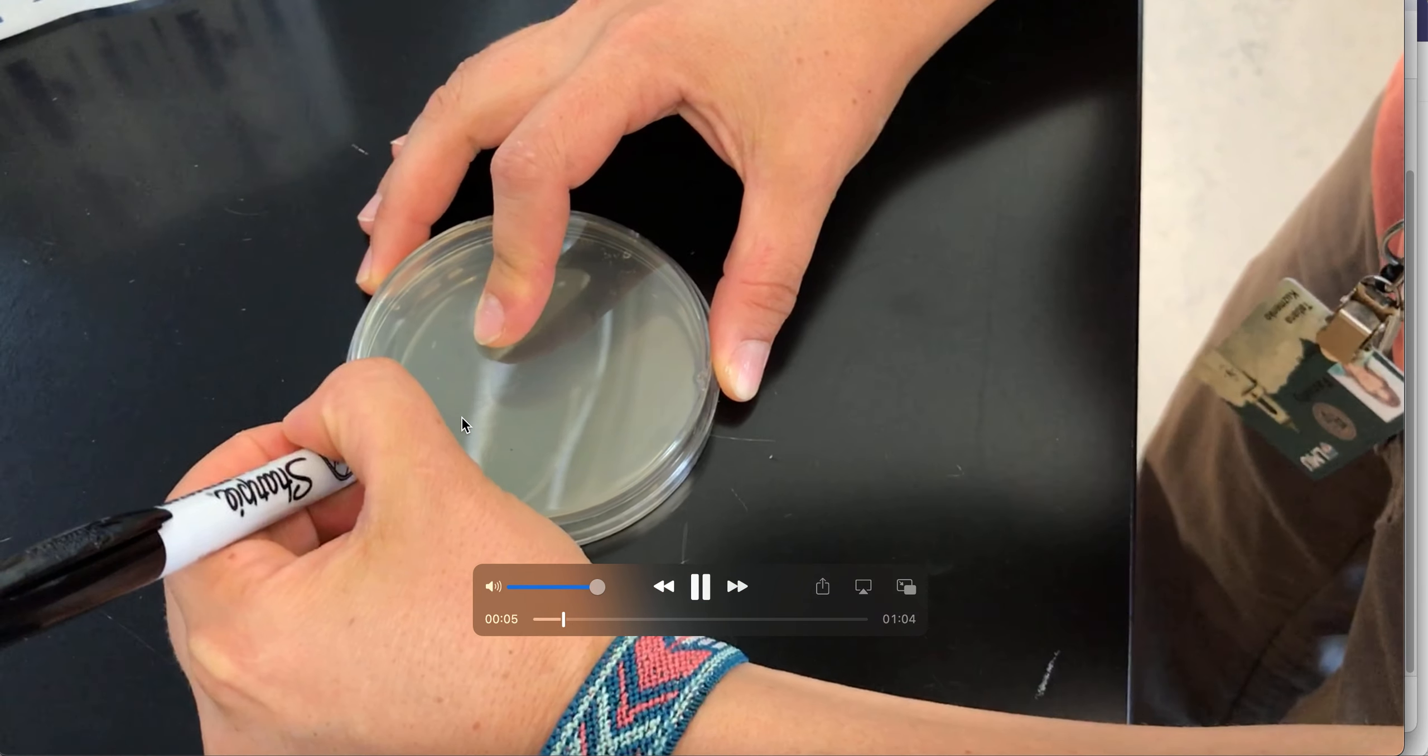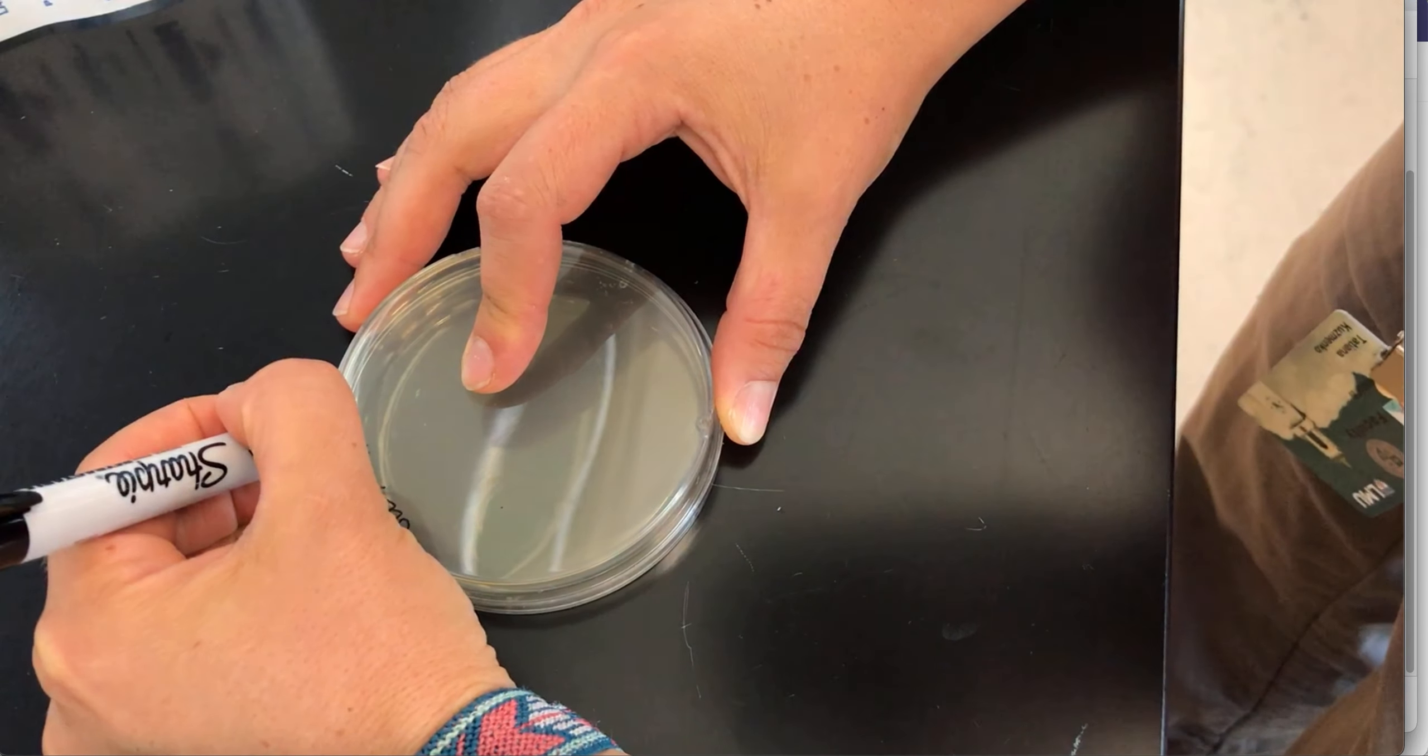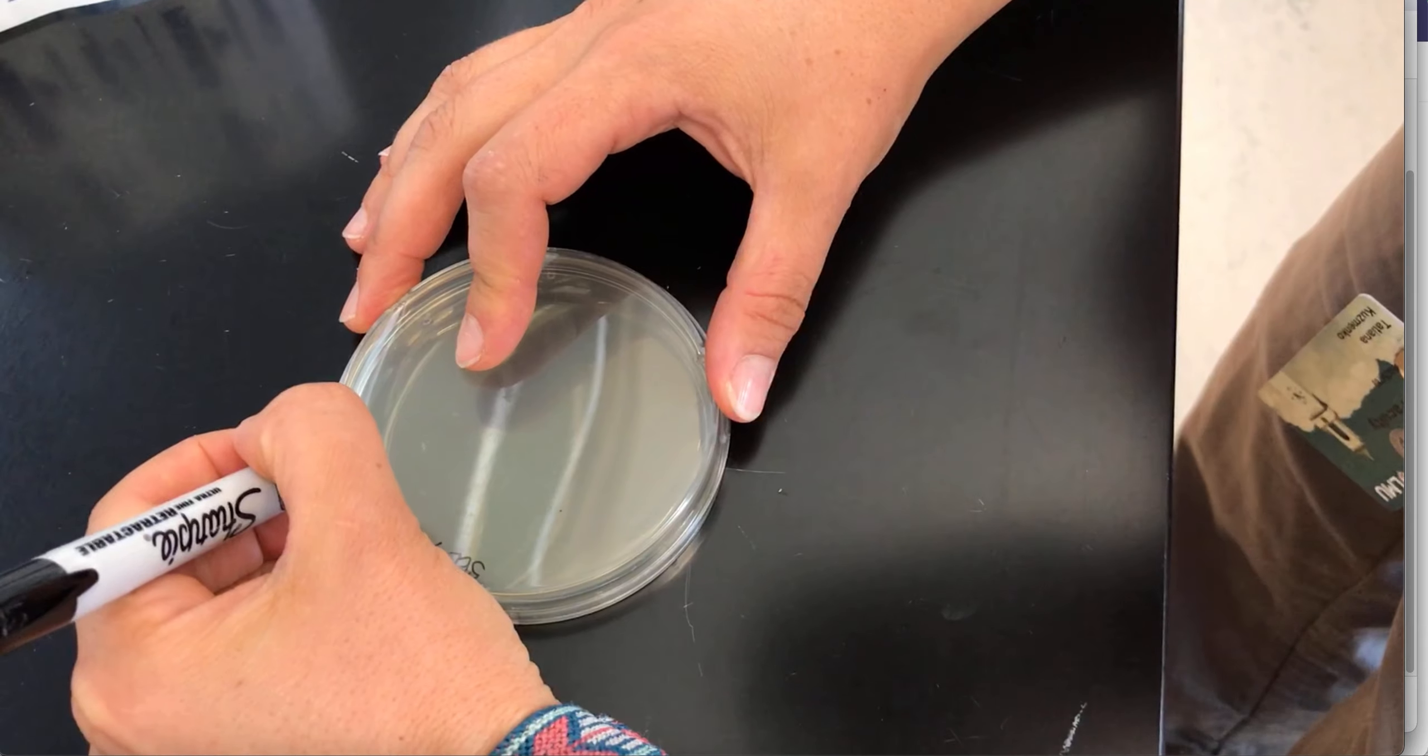Label your plate around the corner with your section number, initials in your group, the date, and the surface that you used.